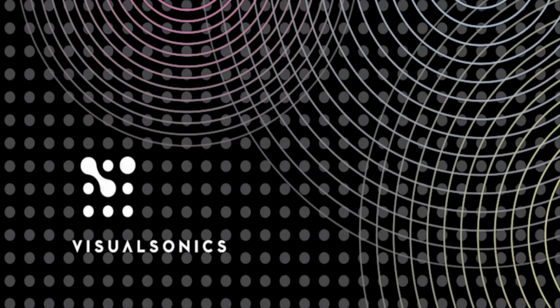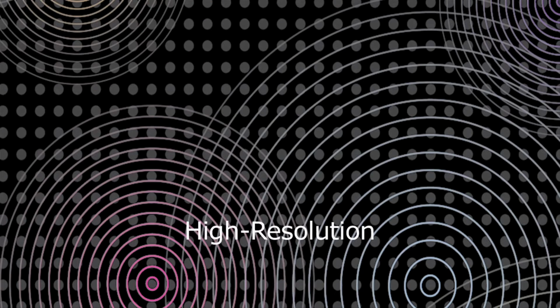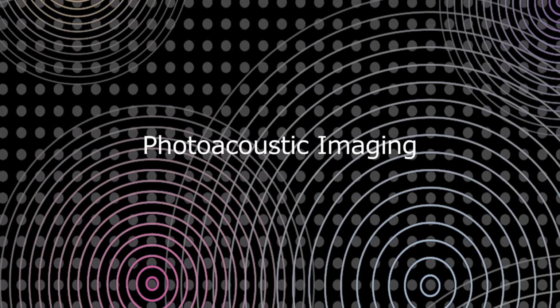Visual Sonics is the world leader in real-time, in vivo, high-resolution microimaging systems, providing modalities specifically designed for preclinical research. You can now listen to the light with photoacoustic imaging offered by the new Vevo LAZR system.